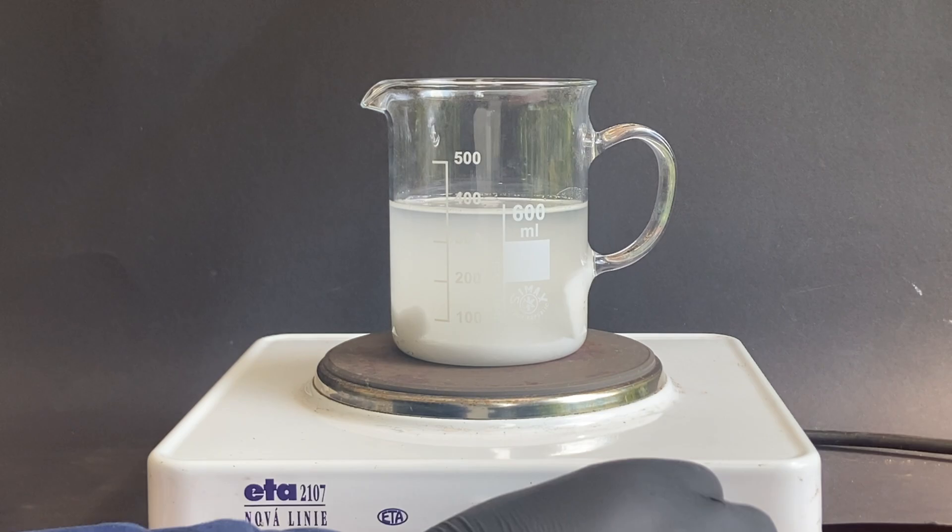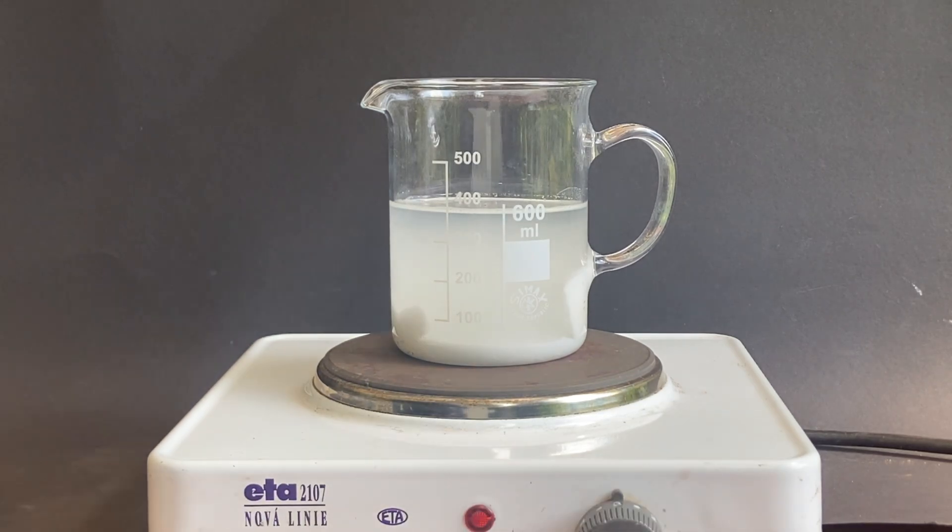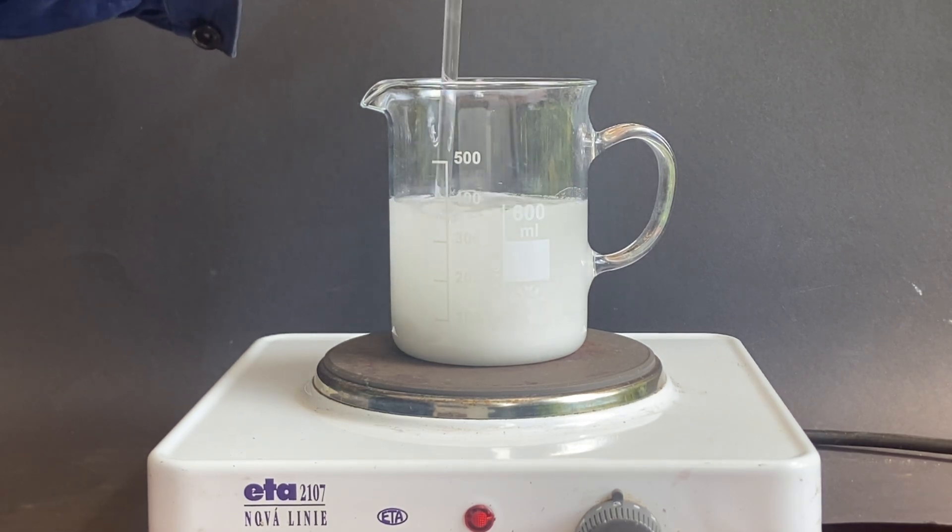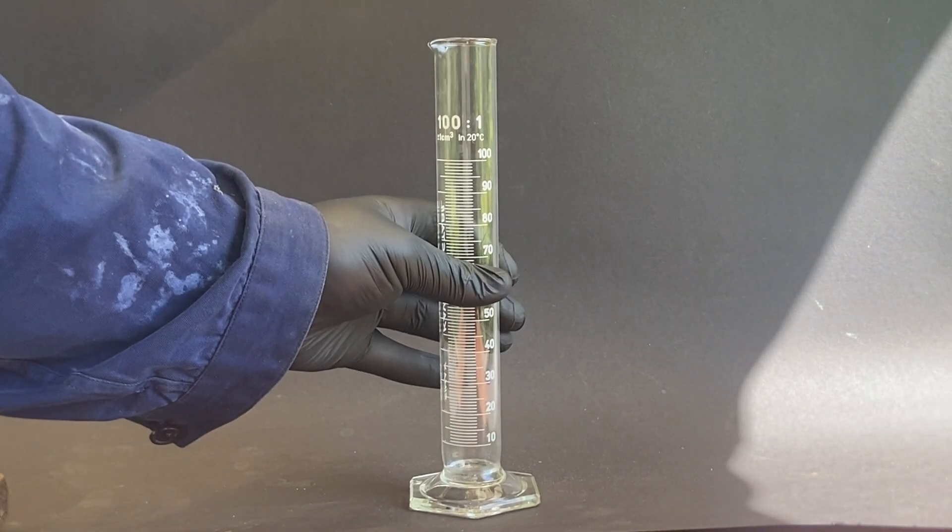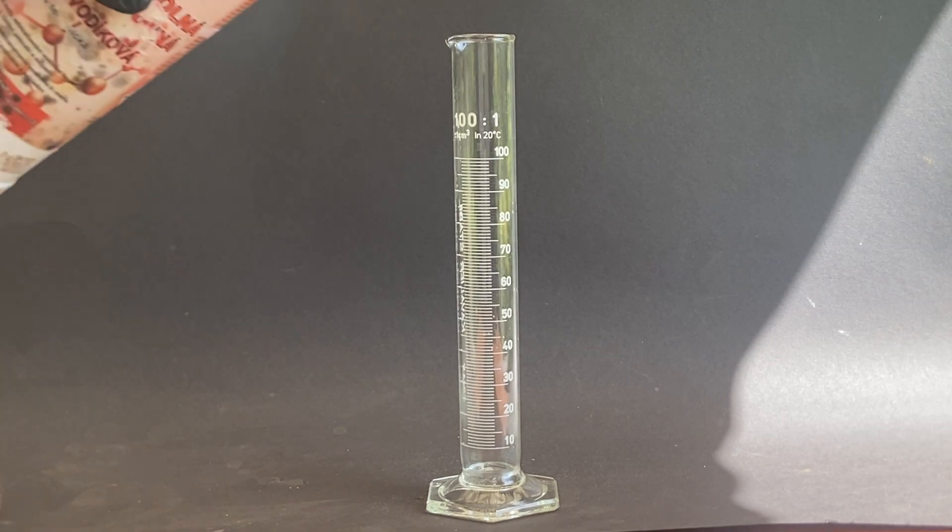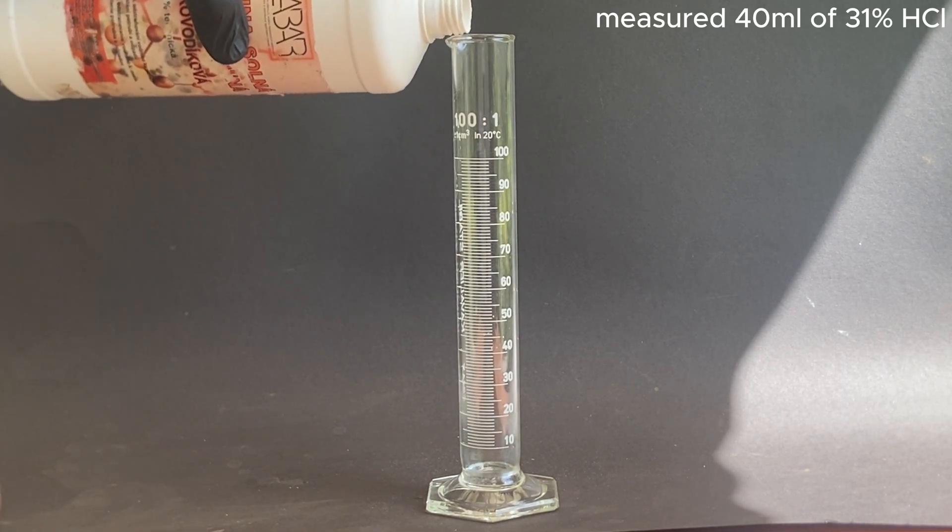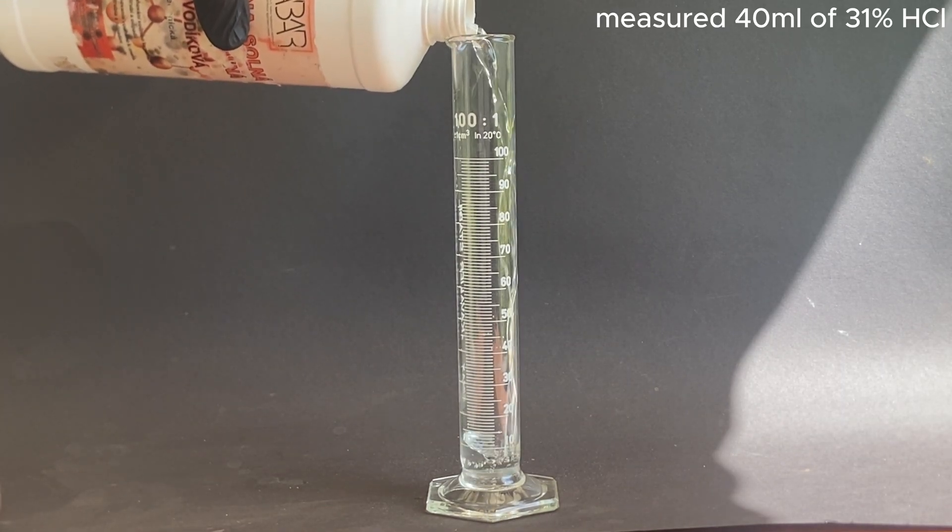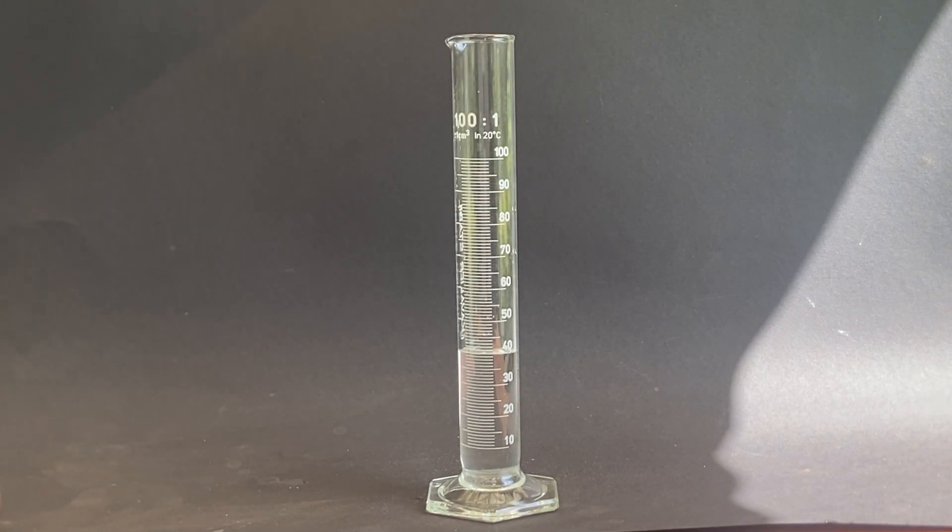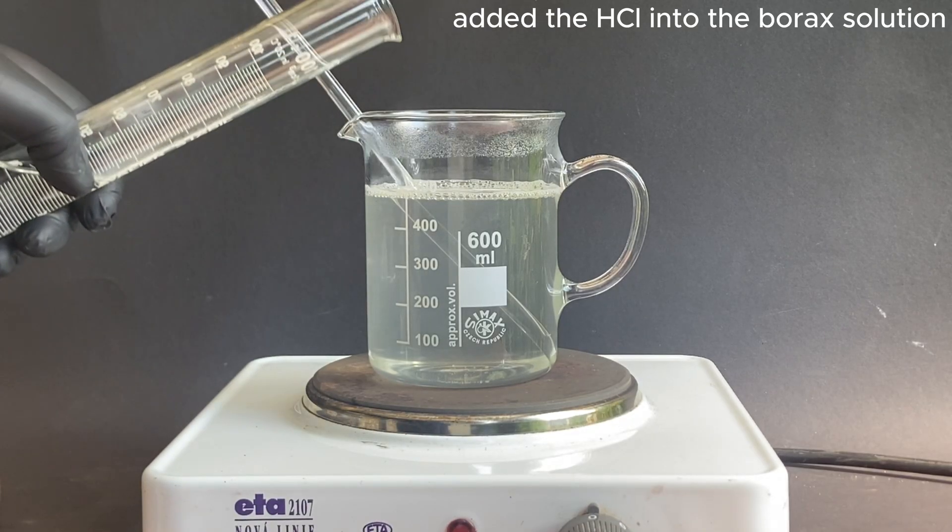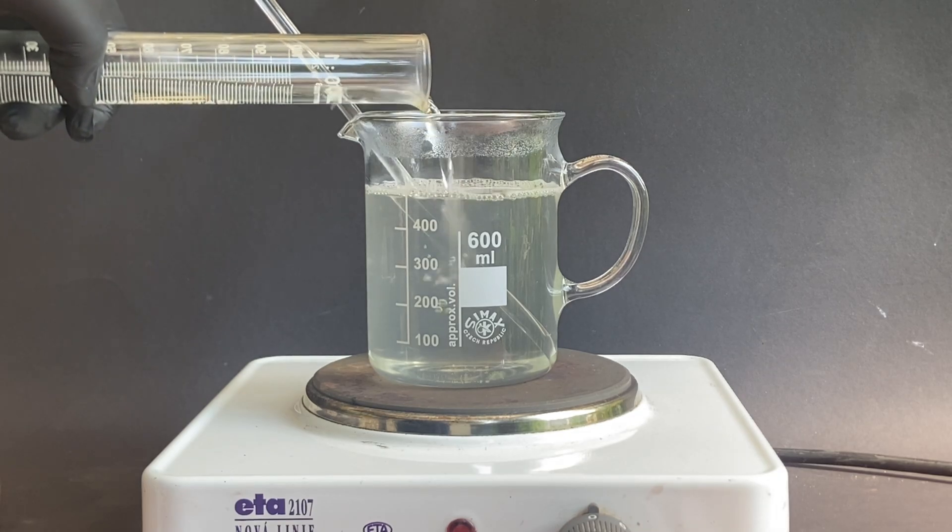Then I started heating the solution. In the meantime I measured 40 ml of 31% hydrochloric acid. After all the borax dissolved, I added the hydrochloric acid into the solution.